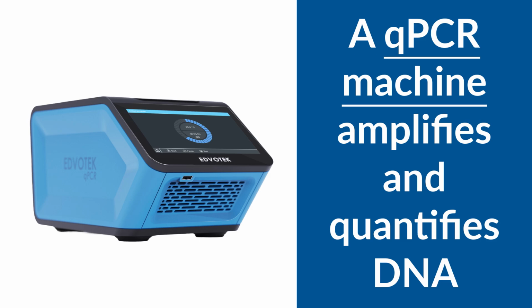Finally, we need a specialized machine called a quantitative PCR machine. Like a traditional thermocycler, the qPCR machine automates the changes in temperature. However, it also measures the fluorescence generated by the reaction.